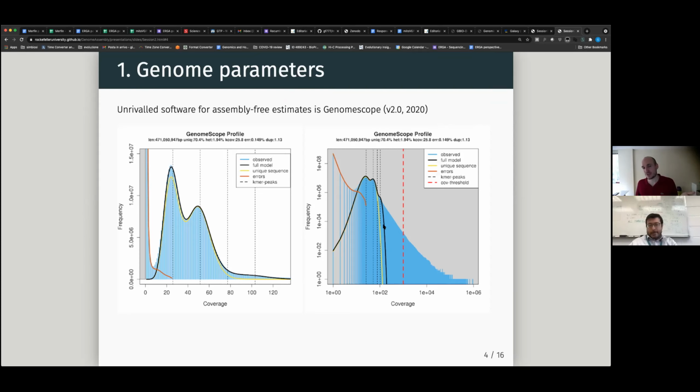Okay, and you can use this information to ask. Of course, it's not just what it looks like here, because this is also in log scale, but it's pretty much the idea. And again, if you have a very repetitive genome, it's going to look much different. In this case, it's not particularly repetitive. We're just talking about 30% repeats.